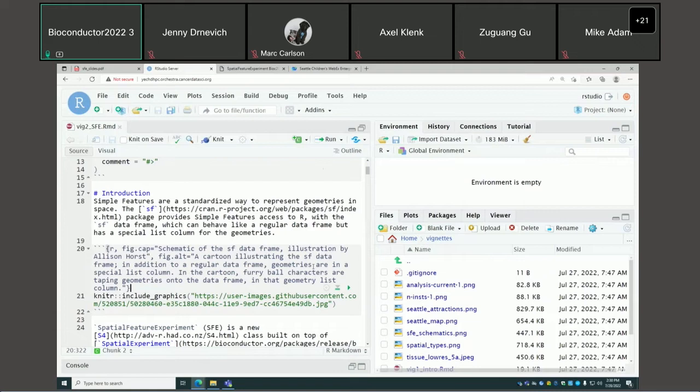Let's begin with the Spatial Feature Experiment class. At the heart of Spatial Feature Experiment or SFE is Simple Features, which is a standardized way to represent geometries in space.